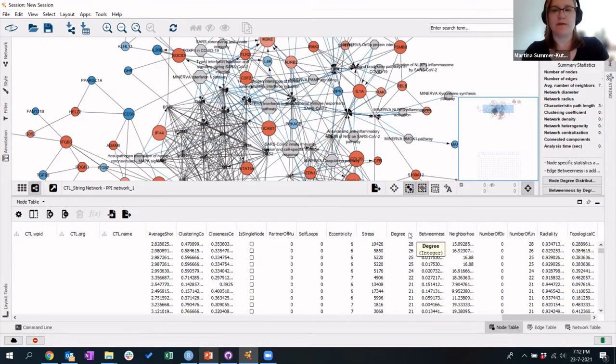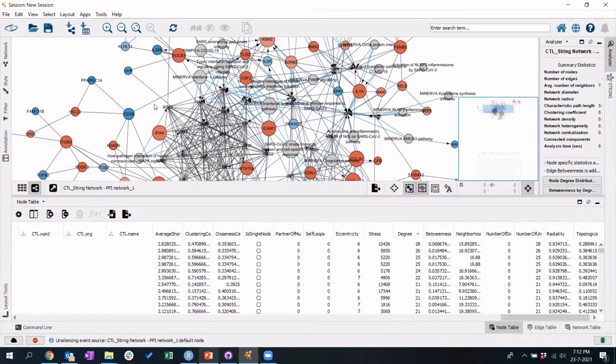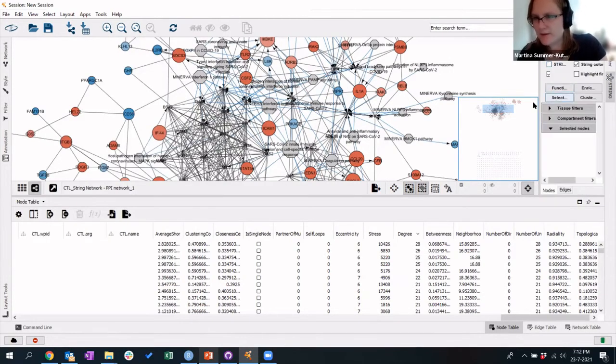Can we do like what Scott showed us yesterday, the donut things, which is like yesterday he showed us how to put the GO terms in a circle? This could be done with the STRING app. I just need to check. I'm not sure if this is now still considered a STRING network, so I would need to check.